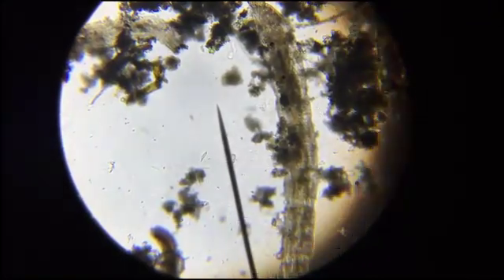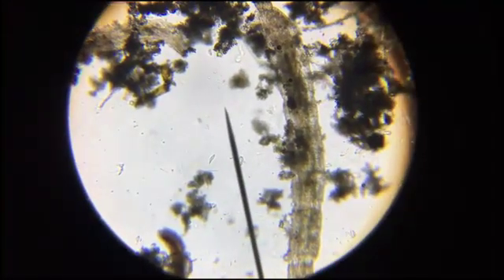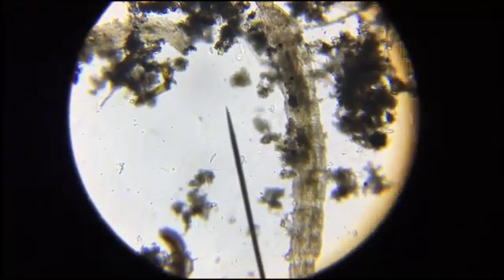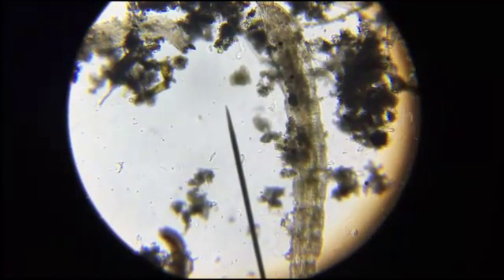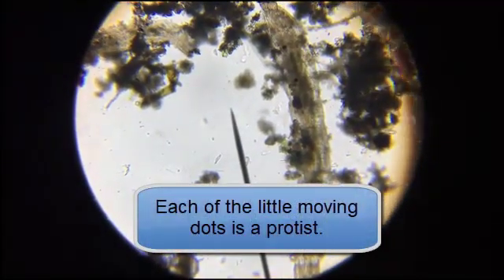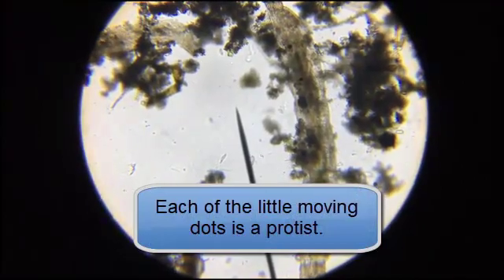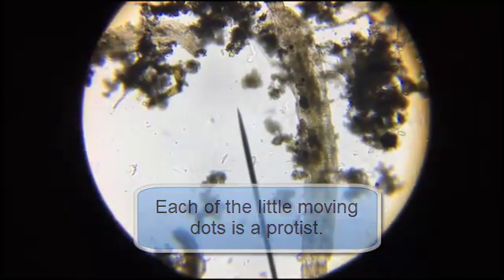There's some plant matter debris. And you can see some protists zipping around all over the place. Very, very small. I'm on 100 magnification.